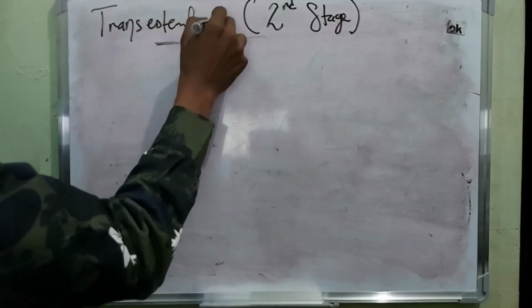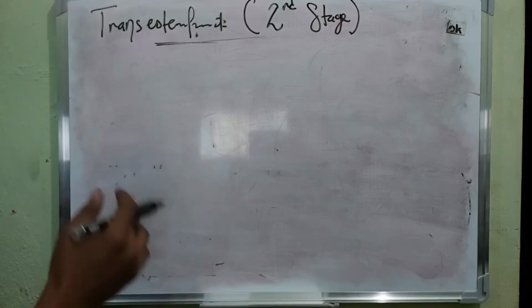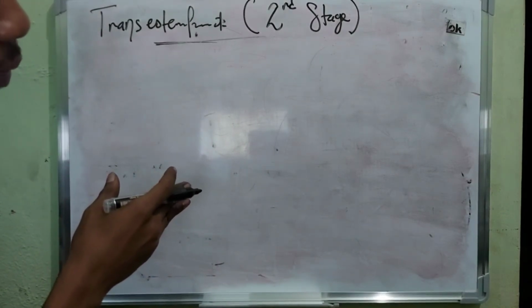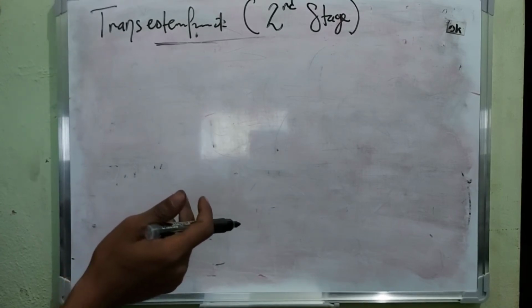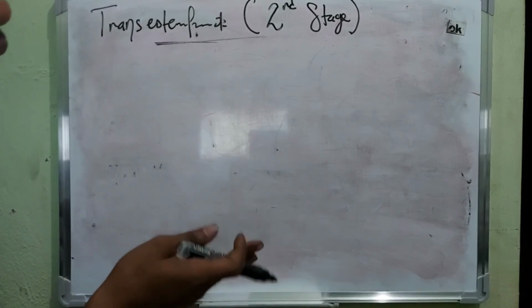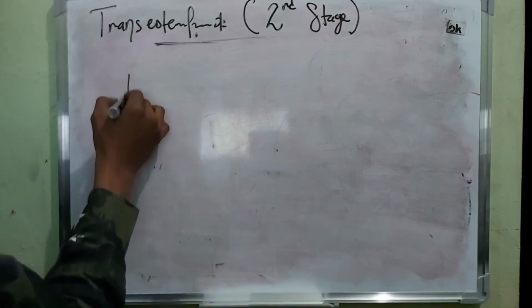So it's just an esterification process. The only difference is that once the system has cooled to about 100-120 degrees Celsius, you can then start up the reaction again. But before you do that, you have to add a measured amount of phthalic anhydride.